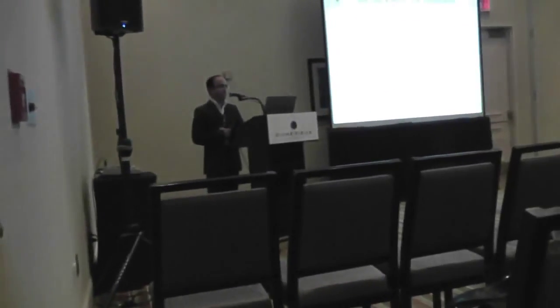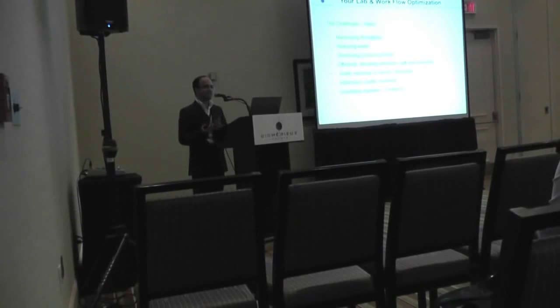Introduction to workflow. Why exactly does your lab need workflow optimization? What are the benefits that your lab can achieve going through the whole process of workflow optimization? As you all will agree, today there are many challenges that a micro lab is faced with.